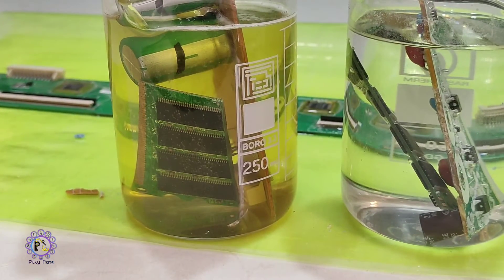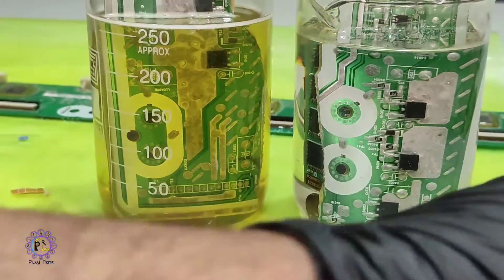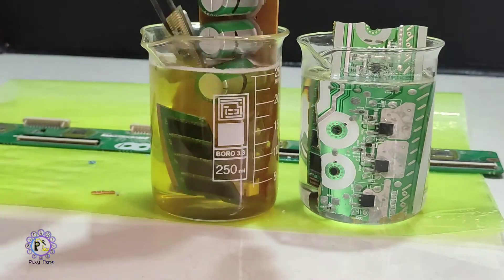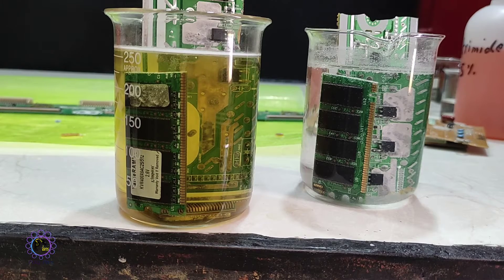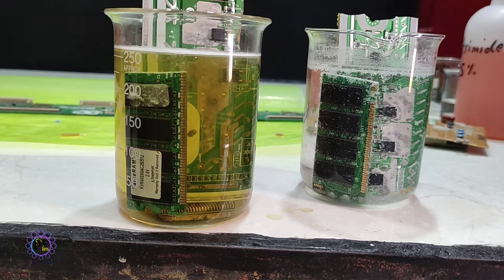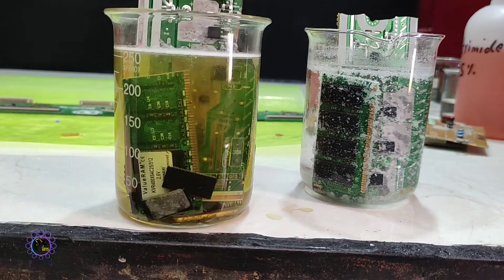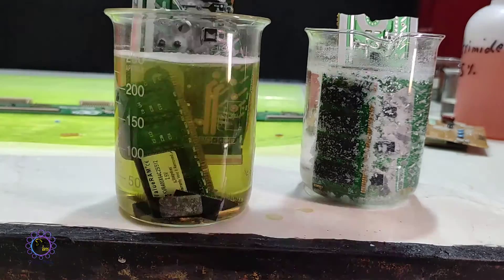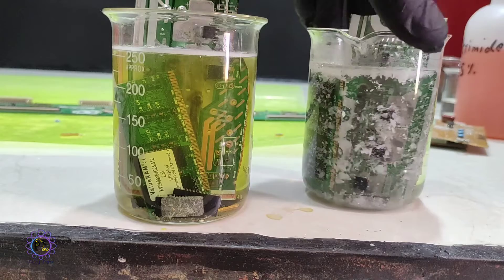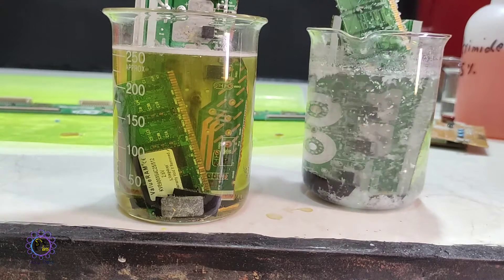In the left solution, bubbles started coming up, which means tin was being dissolved, while no bubbles were forming in the right-sided solution — the tin dissolution rate was much slower there. In this time-lapse captured over 45 minutes, the high efficiency of the ammonium quaternary-based solution is obvious. It easily dissolves the solder area, causing the underlying copper section to become exposed, and IC chips were detached after only a few minutes. In the urea-based solution, some IC chips were also detached after 45 minutes, but urea nitrate crystals started growing on the PCBs.